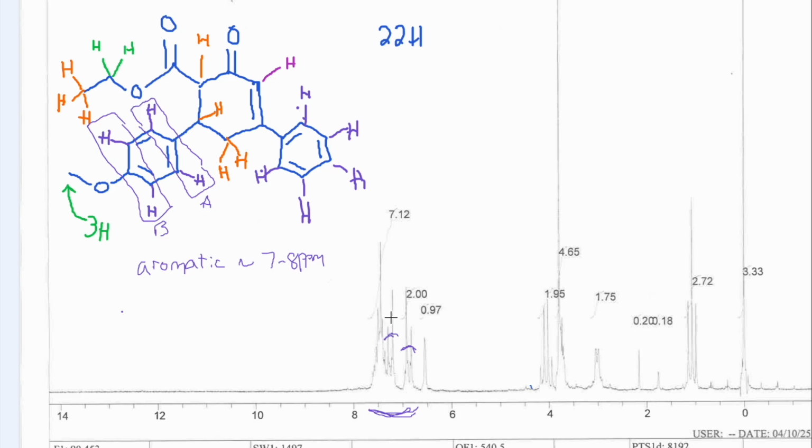They're each worth 2. So probably I would think that the B is a little bit further upfield because it's closer to the oxygen. I'm not 100% sure about that, but that was probably B and probably A, but maybe they could switch. I'll put a little question mark here. They're pretty close together though, and they're all in the aromatic region.